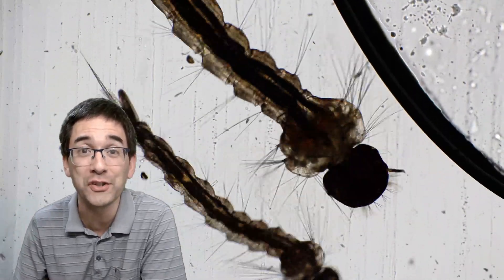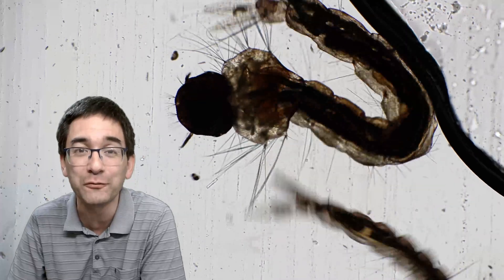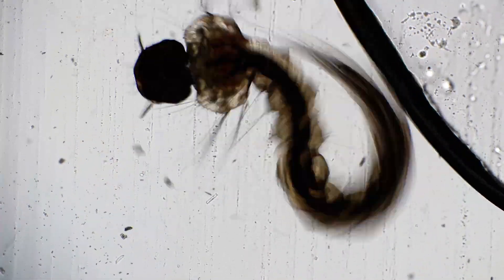This is one of the deadliest animals known to humans. It causes up to one million deaths every year, and today I'll put it under the microscope.